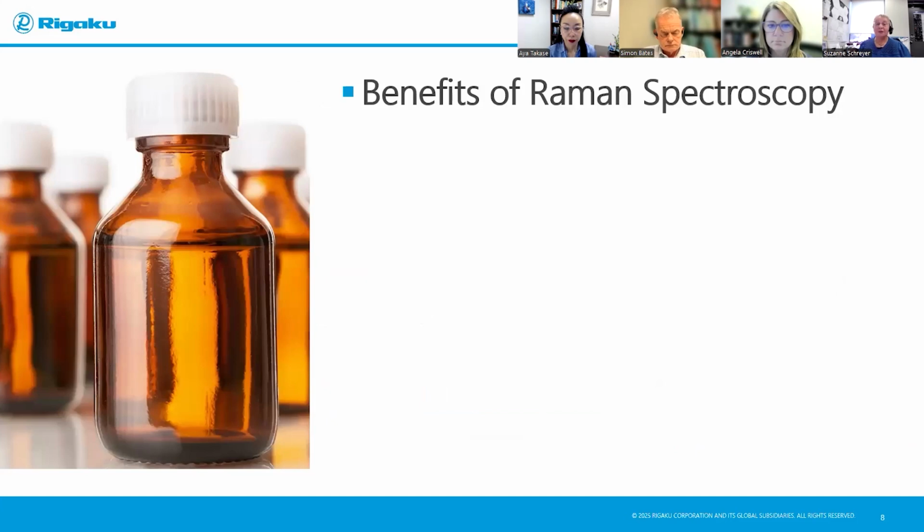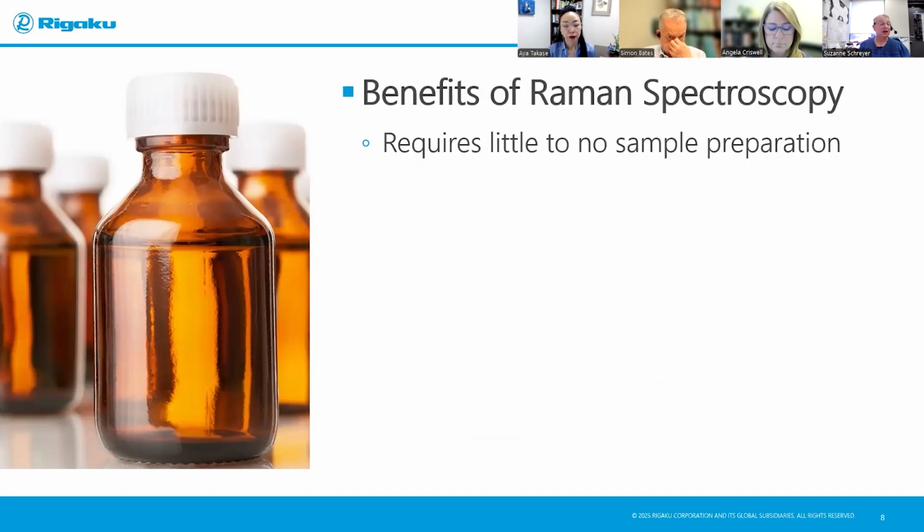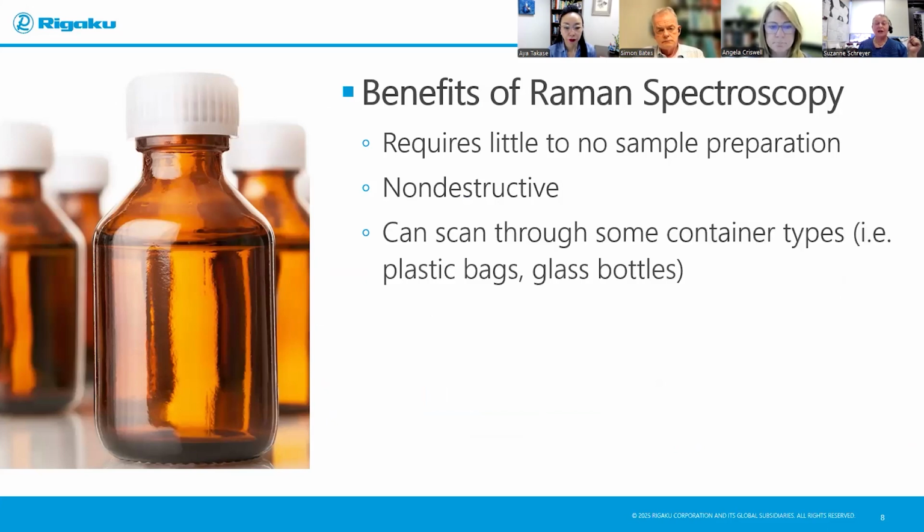Well, the nice thing about Raman is it requires little or no sample preparation. If you have a bottle or a drum, as long as you can see a sample inside, you can scan it. You don't have to open anything up. It is also a non-destructive technique. When we scan through the container and analyze what's in there, we hope none of this material will be destroyed or changed in any way.